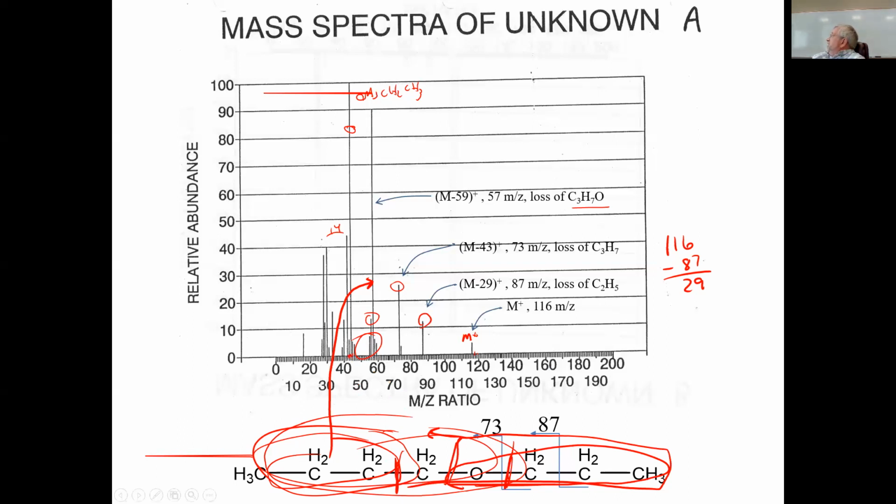Okay. It's really hard, if you don't have the empirical formula, if you don't have the molar mass, to go through these fragmentations. And some of these peaks make no sense. So it just gives you the mass to charge and you go backwards from there?